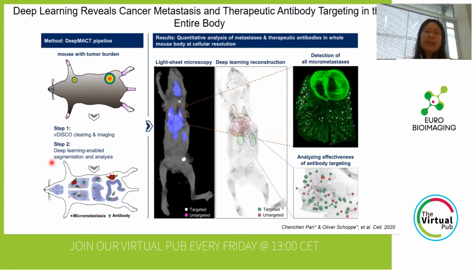So the next example is that we want to use this method to study cancer metastasis and also therapeutic antibody efficiency.